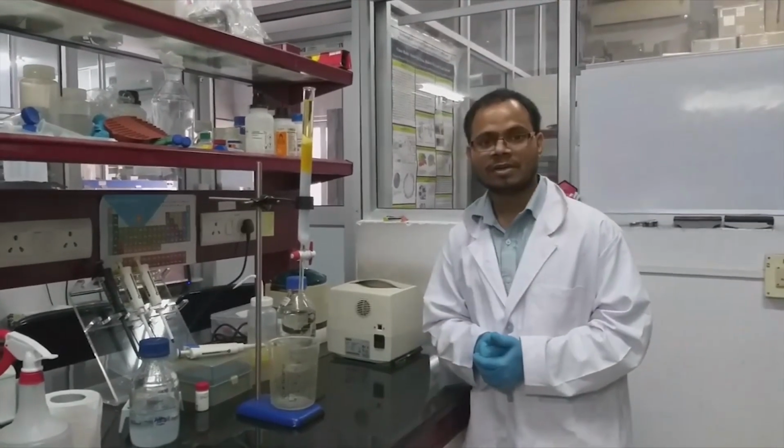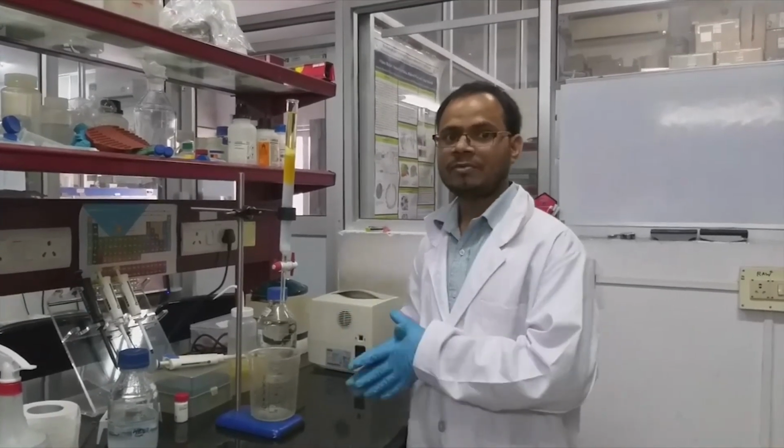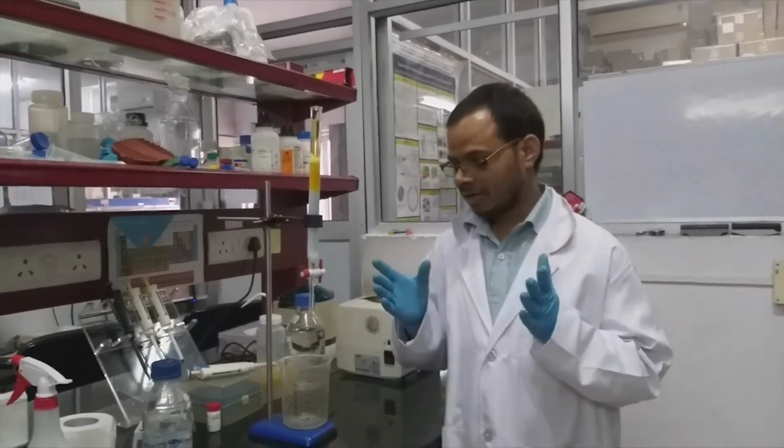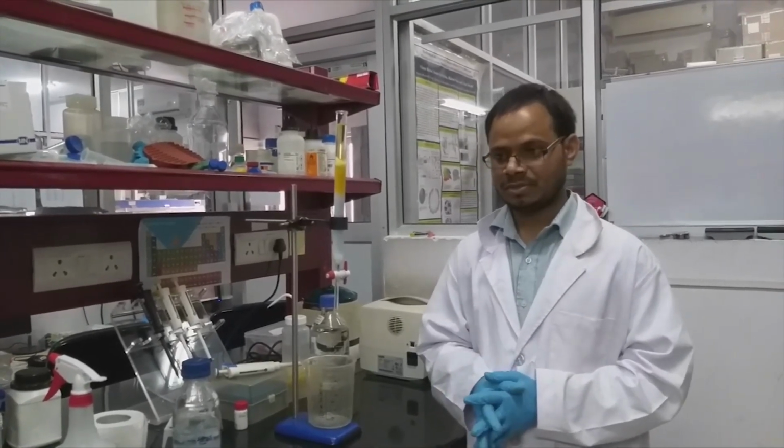So this is all about gel filtration chromatography. This is not only manual or gravity based. You can also use it in different instruments like FPLC or other protein purification systems.